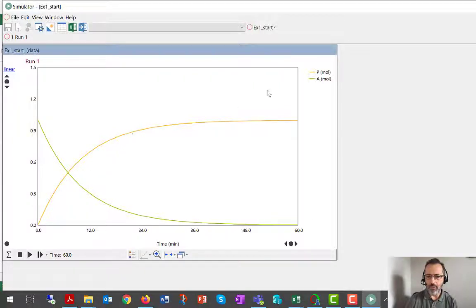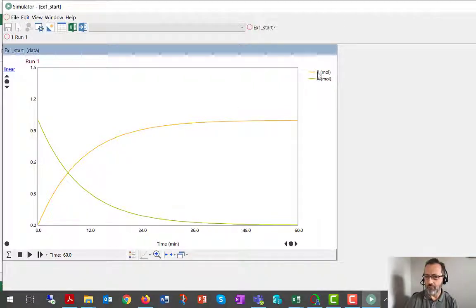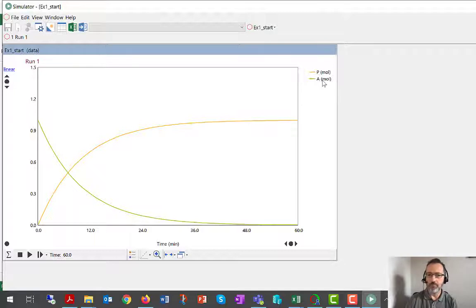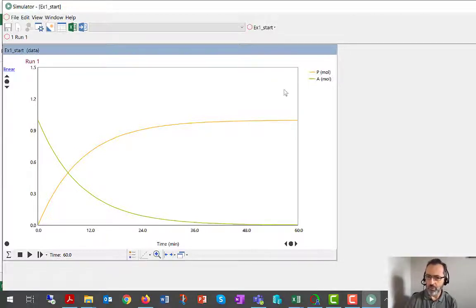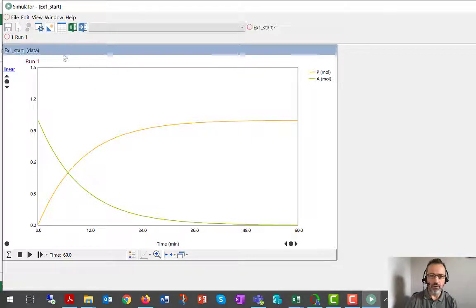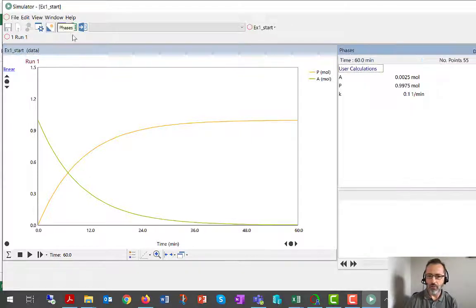And you'll see that you just get the variable name without the word variables in front of it. So we're used to seeing solution.p here. Now we just see p, a user-defined variable.